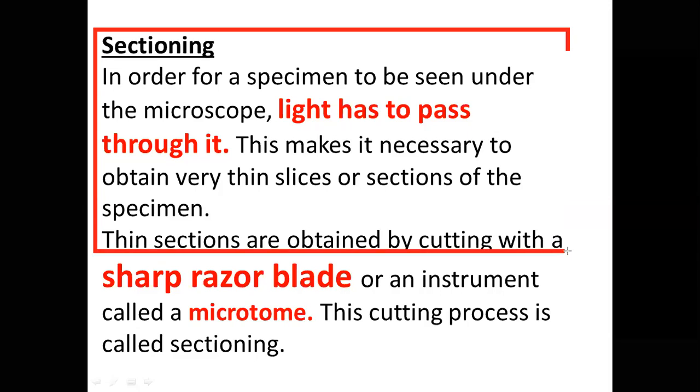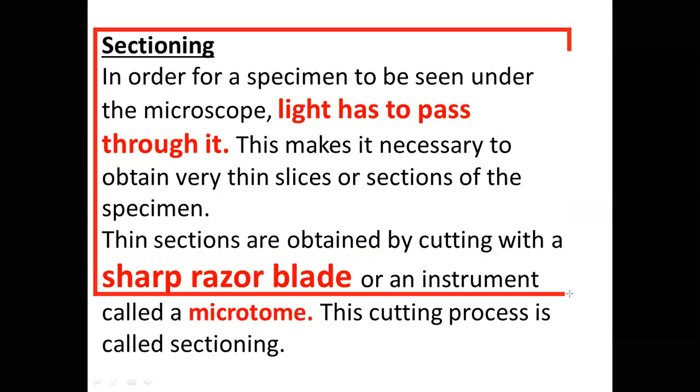So these sections are made either using a razor blade or what we call a scalpel. Of course, in advanced labs, we use another instrument called a microtome. And we will come back to it because it's good to have that backdrop.